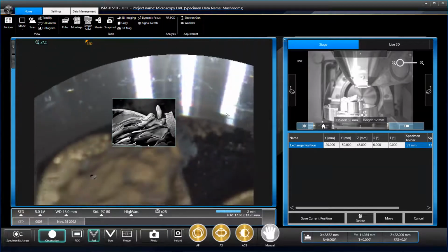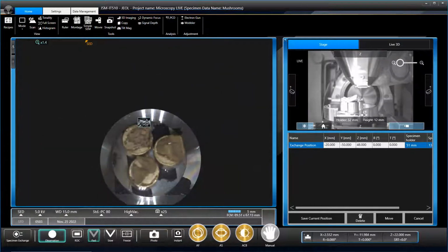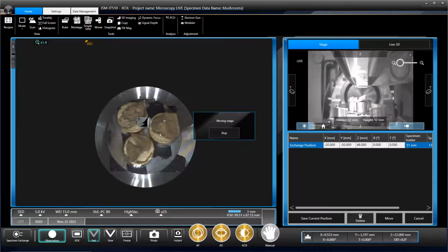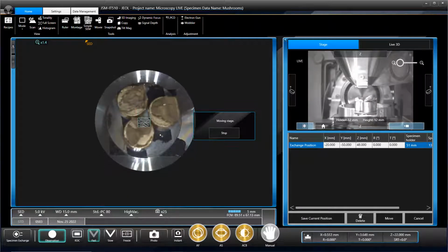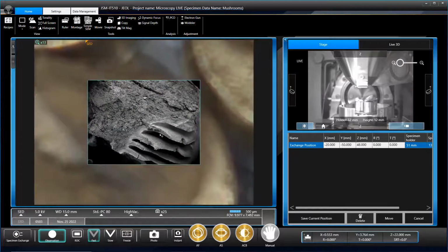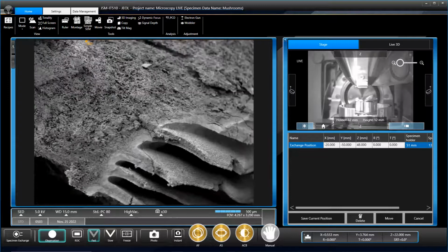So the useful thing about this instrument is that when we first put the sample in, you can take an image registration. This is exactly how the samples look inside the chamber at the moment. It's really useful to drive around because you can look and see where you want to go and just double click and it'll take you there. You'll see it on the little infrared cameras that are whirling across. We've got spoiled recently. There are some instruments that don't do that. This one does. It makes me very happy.